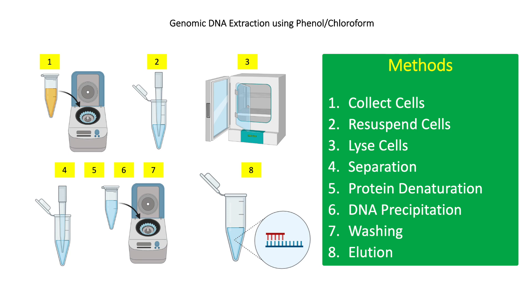For step seven, wash the DNA precipitate with 70% ethanol. Centrifuge at 13,000 RPM for 10 minutes, then discard the supernatant. Remove the remaining ethanol using a pipette. Air dry at room temperature.